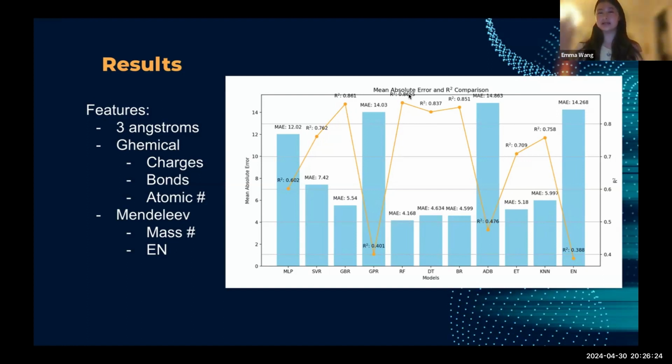So it does what its name is, finds the mean absolute error between the ground truth values and the model's outputs. Ideally we want a very low MAE of 3 and below ppm.